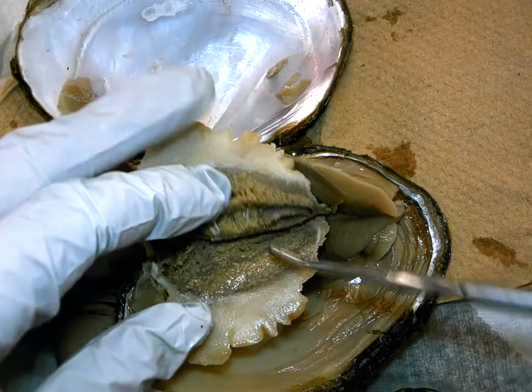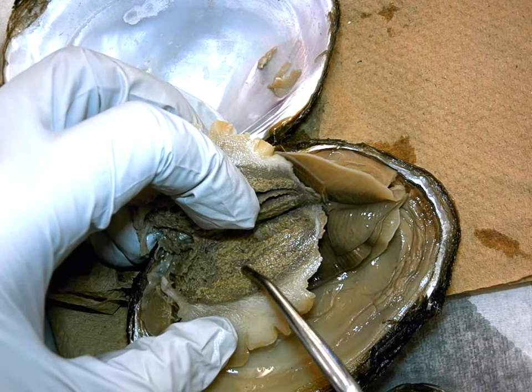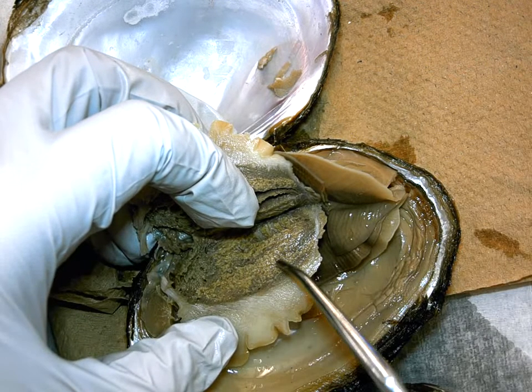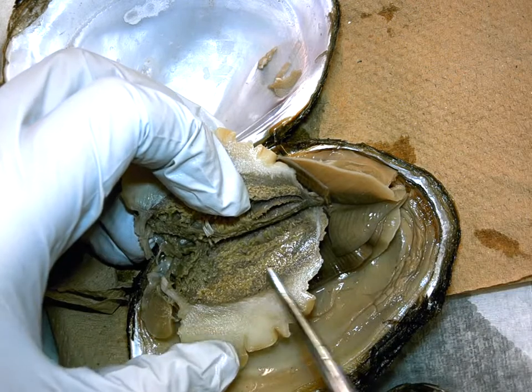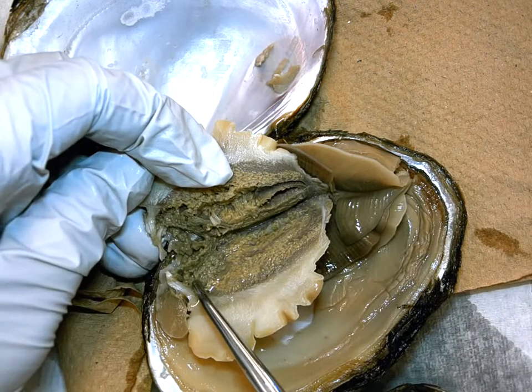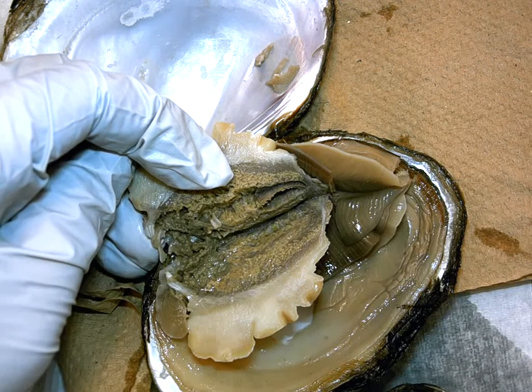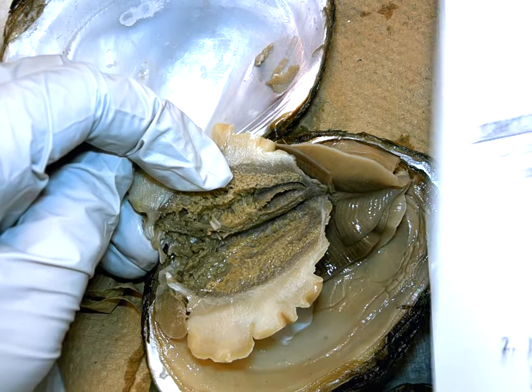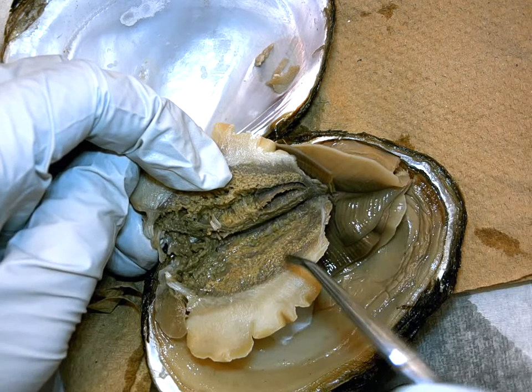Now the other thing it wants us to see in here, besides the coiled up intestine, is all this kind of yellowish gooey stuff that's around it, and all of this is the gonads. Now the most anterior in this visceral mass location is kind of this green colored tissue, and this green colored tissue is called the digestive glands. And then there's a bunch of questions in the lab that are going to ask you about this area.